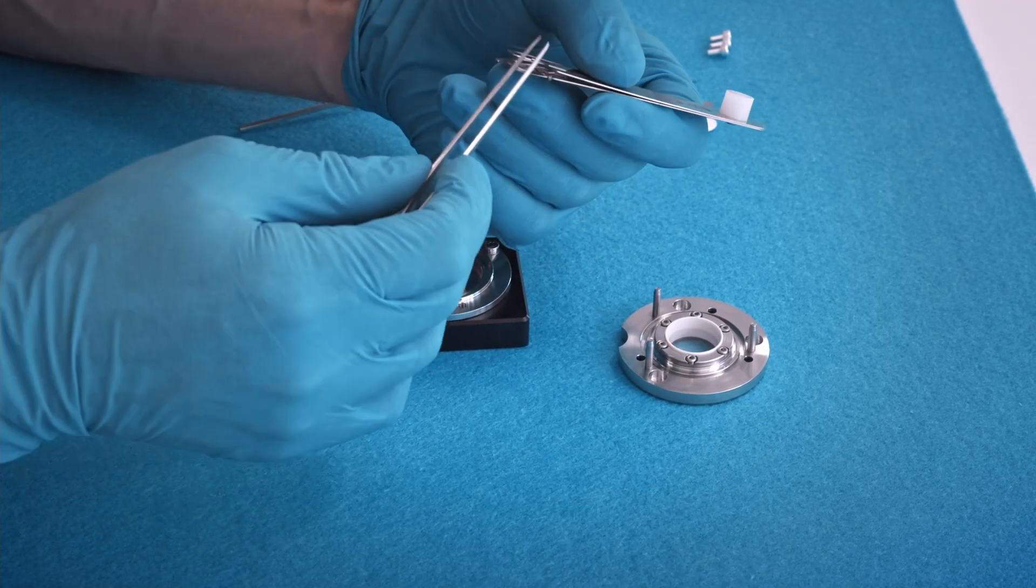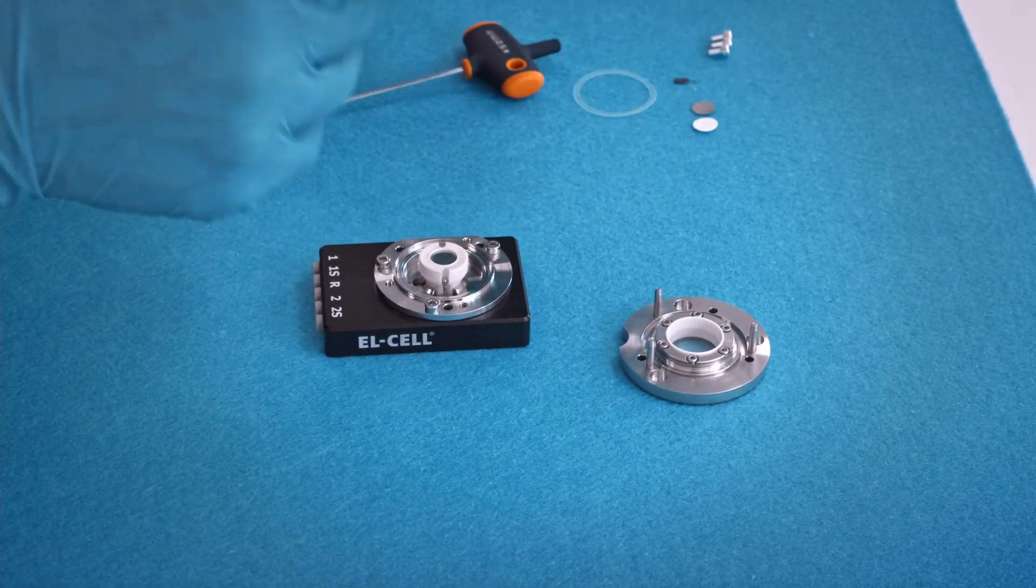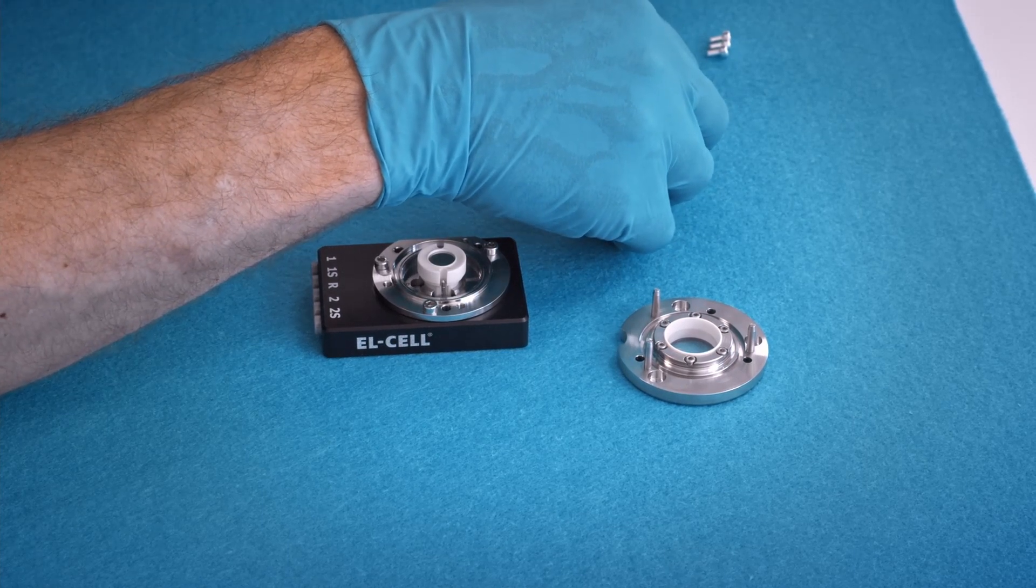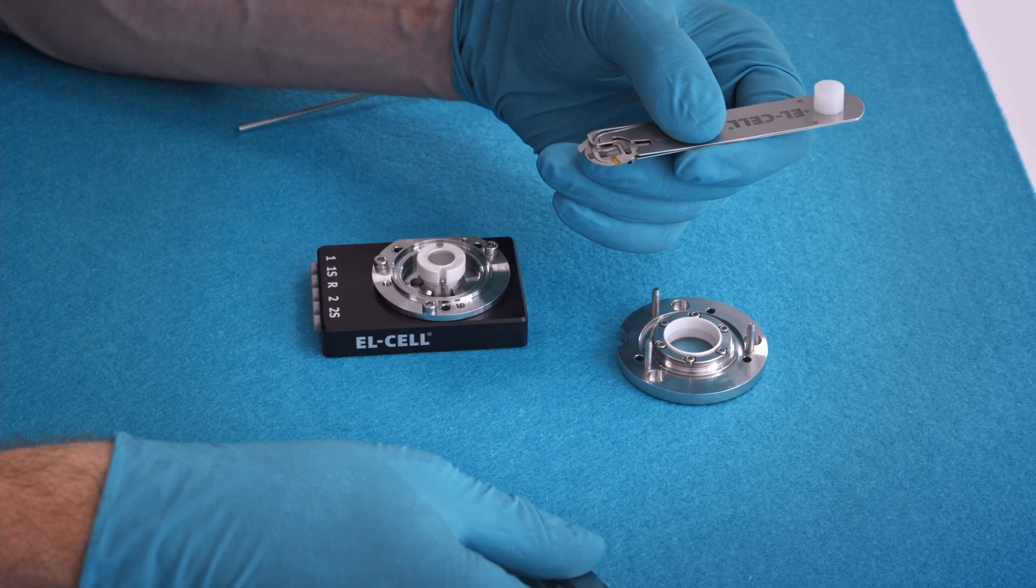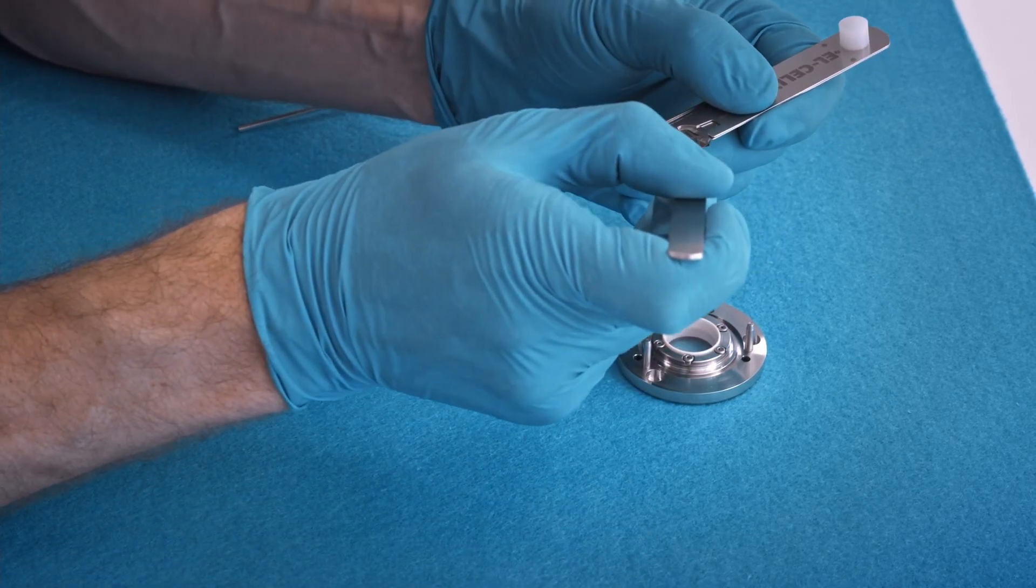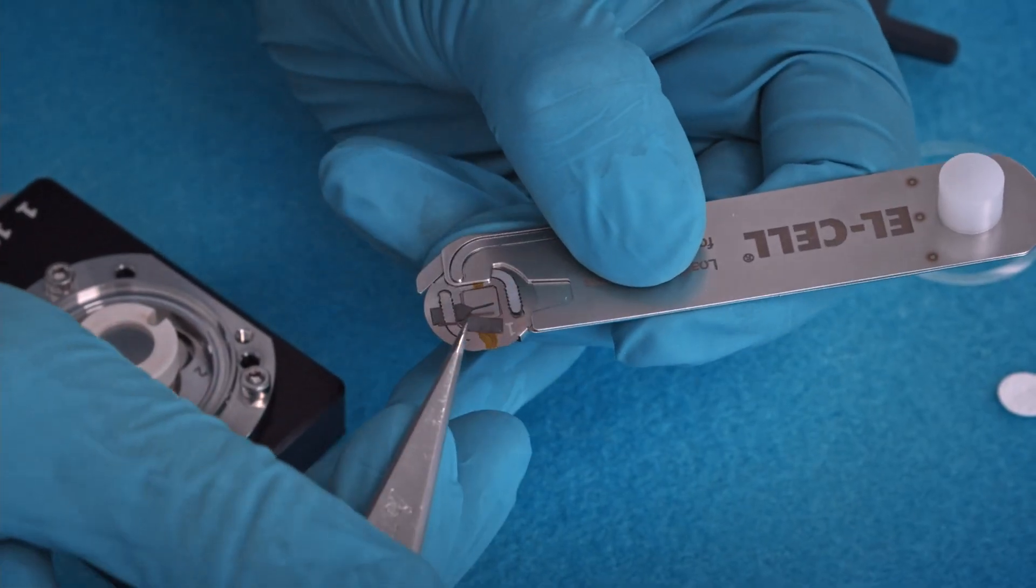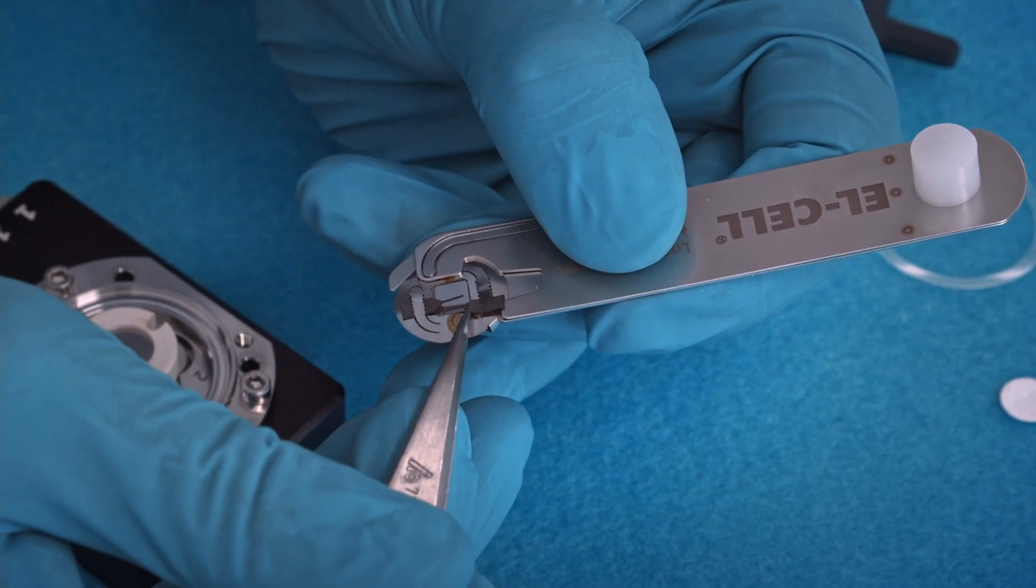Do the same for the second strip. When you compress the tweezers, then the finger lifts, and you can put the electrode strip below this contact finger.